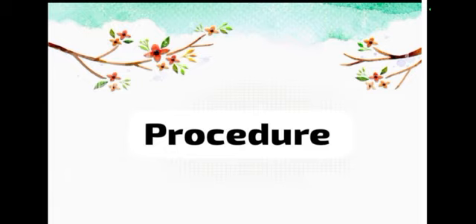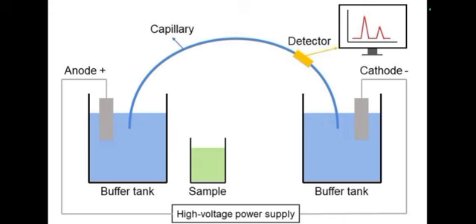Next we see the procedure of capillary electrophoresis. In this structure, high voltage power is used.